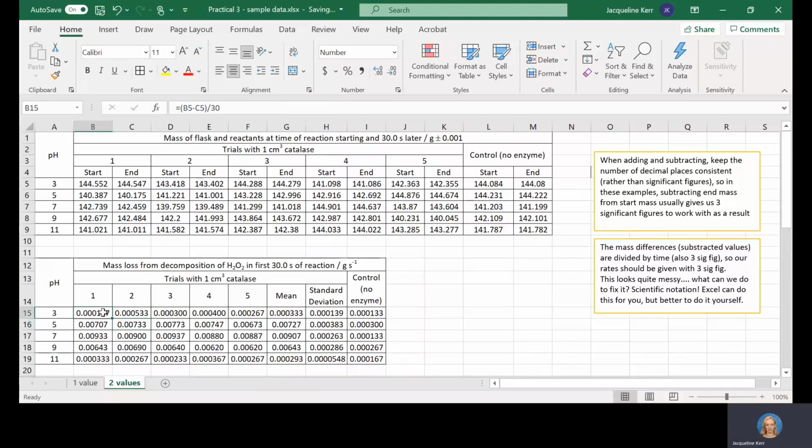So that this one lines up with these 2 values, this one lines up with these 2, this one with these 2, and so on. Okay, a little bit tedious, but not the end of the world. If you fix it in this first row, then you can highlight that first row and copy and paste them down, and it's fine.